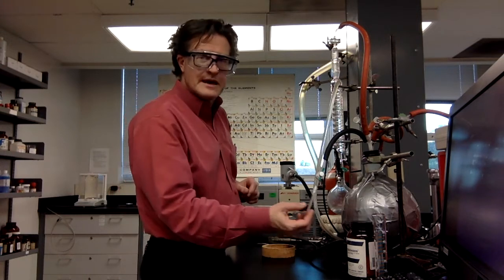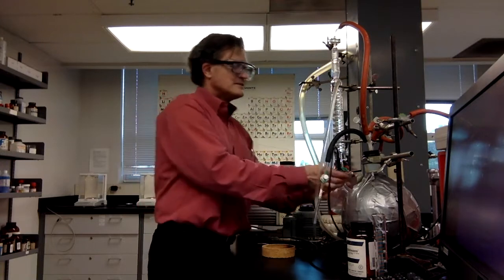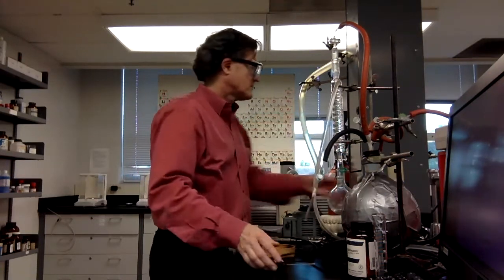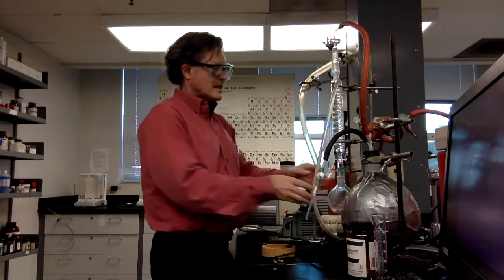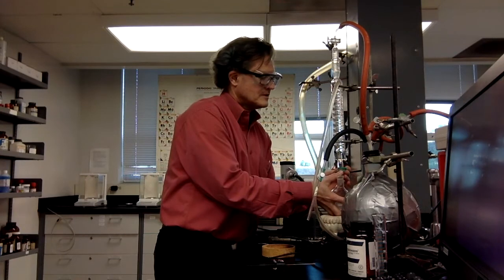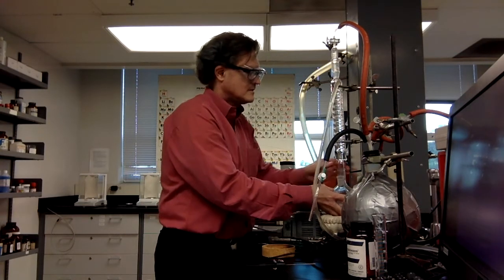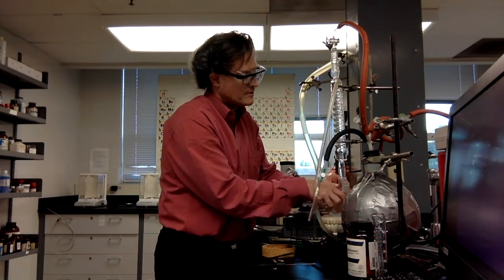Put this back up to atmosphere. It isn't hissing anymore, so it's not leaking. That means we can get the thermistor off of there, we can turn off the water, and take off the little clips. And then we're able to just twist that, boom, get it off of here.